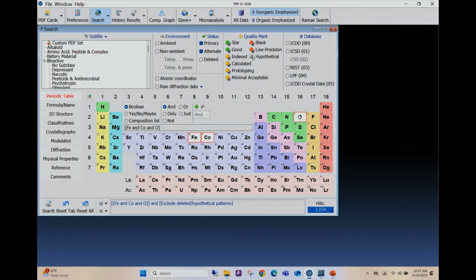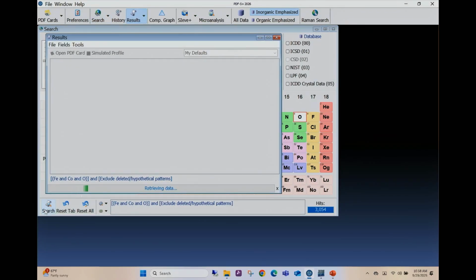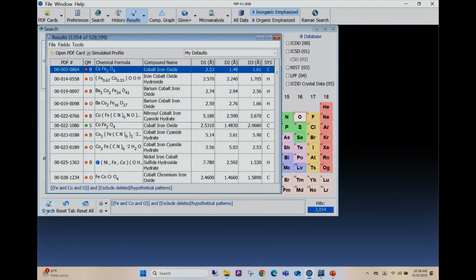How do I open up this search? In the bottom left, you'll see a search icon. Click on that. Now, if you're using the web search, keep in mind it's going to move just a little bit slower. You're going from Italy to California, back to here, and in California, they're probably not even out of bed yet. There's just a little bit of delay, okay?